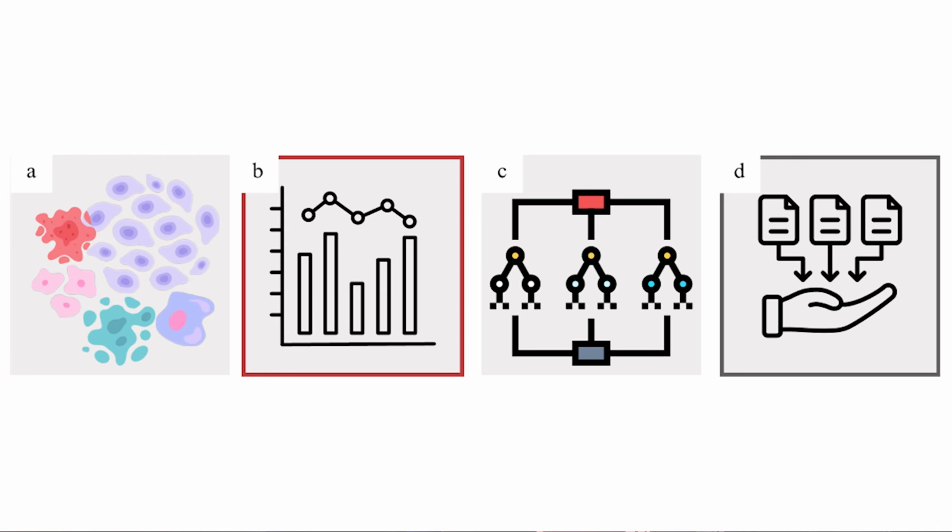Aside from separating signal from noise, what are the typical AI tasks you can use in electron microscopy? There are quite many. It always depends on the application or samples or whatever you want to do. I would start probably with classification, but actually on this picture I can describe all of the typical tasks.